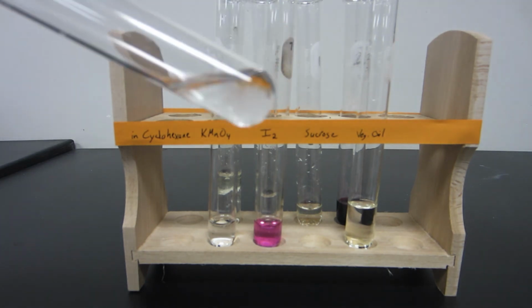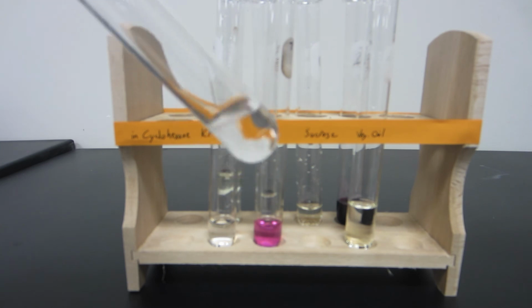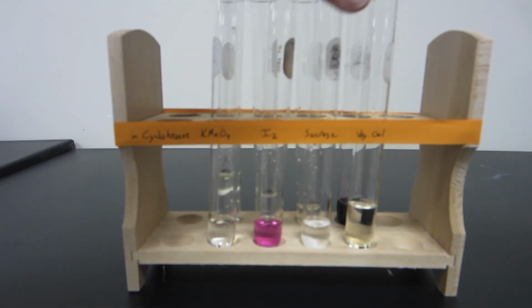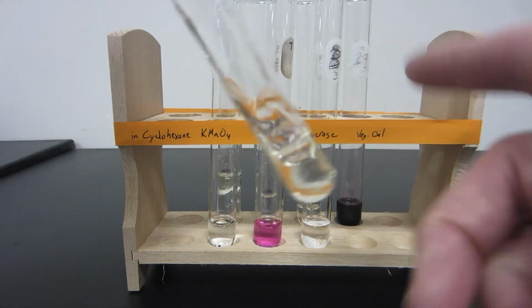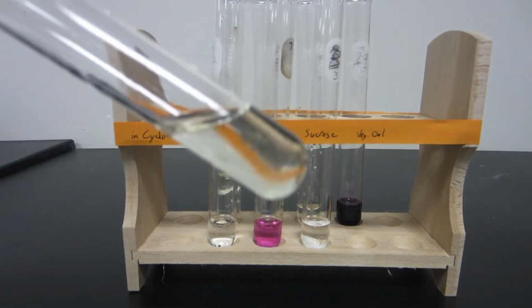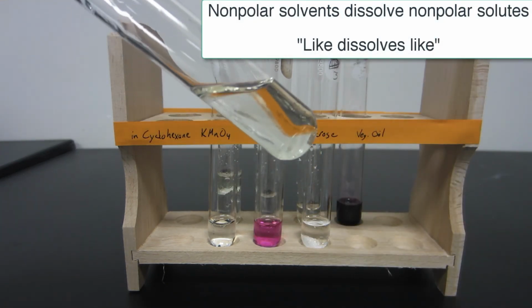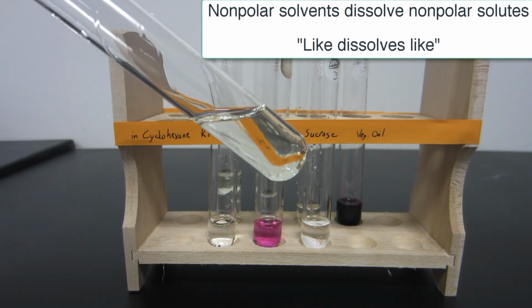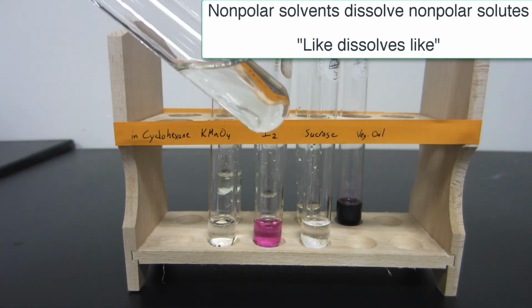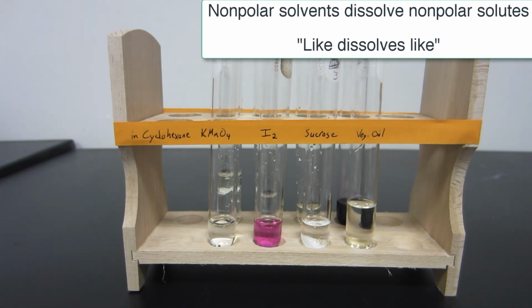Now for the sucrose, that is not dissolving at all. No matter how long we wait, that solid is not going to disperse into the solution. Now if I look at the vegetable oil, notice that there's no distinct layer there. Vegetable oil is dissolving into the cyclohexane solvent. So that tells us what we kind of already know, that the vegetable oil is a nonpolar substance.